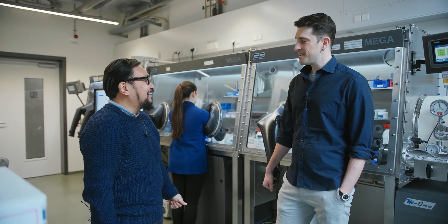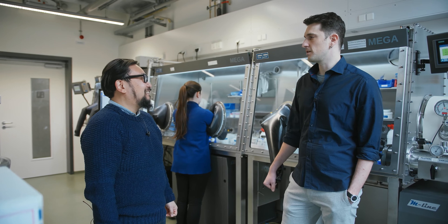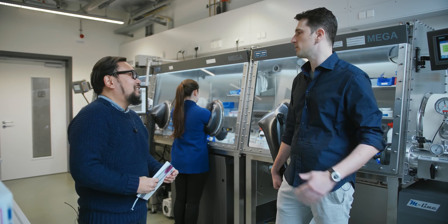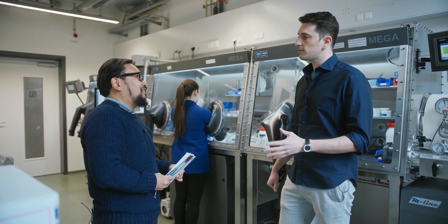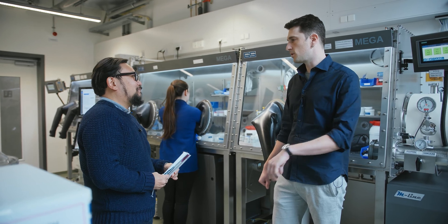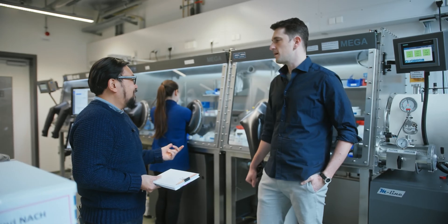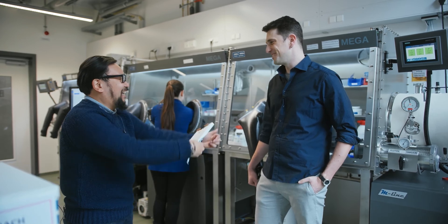I'm pretty pumped because you told us last time we were going to cut open a battery to analyze it. What are we looking at here? If we want to open the battery we cannot do it in normal atmosphere, so we have to go inside the glove box to avoid any damage because of the oxygen. What would happen if we didn't cut it open in one of these boxes? There can be unwanted side reactions inside the material and also the electrolyte is poisoned. So it would not be good for us and maybe explode? If we are not careful enough, it will explode.